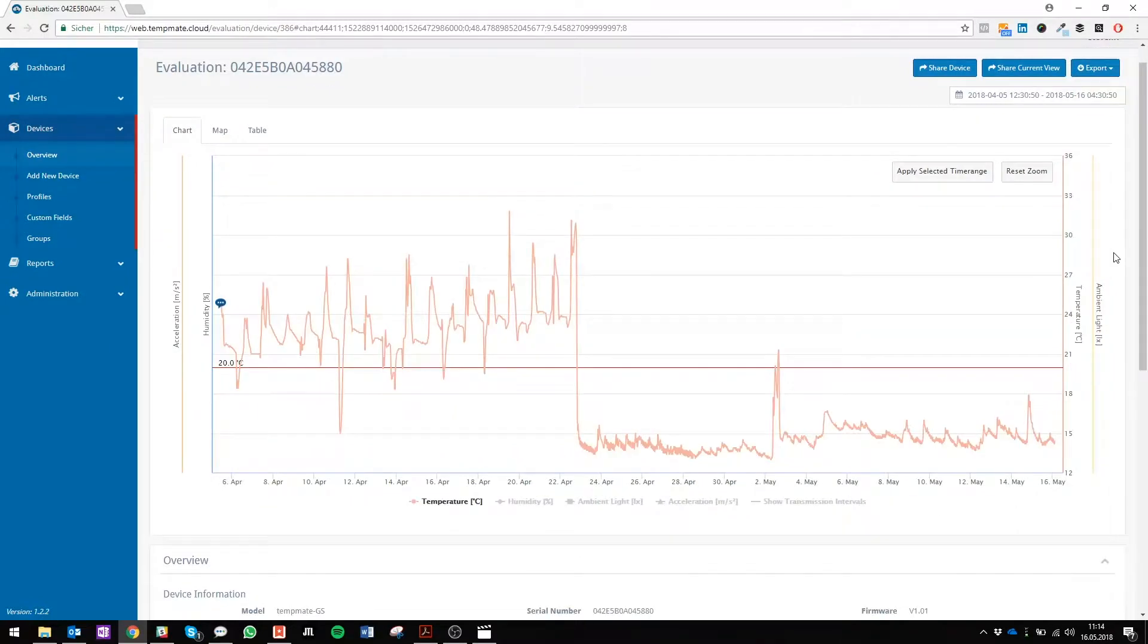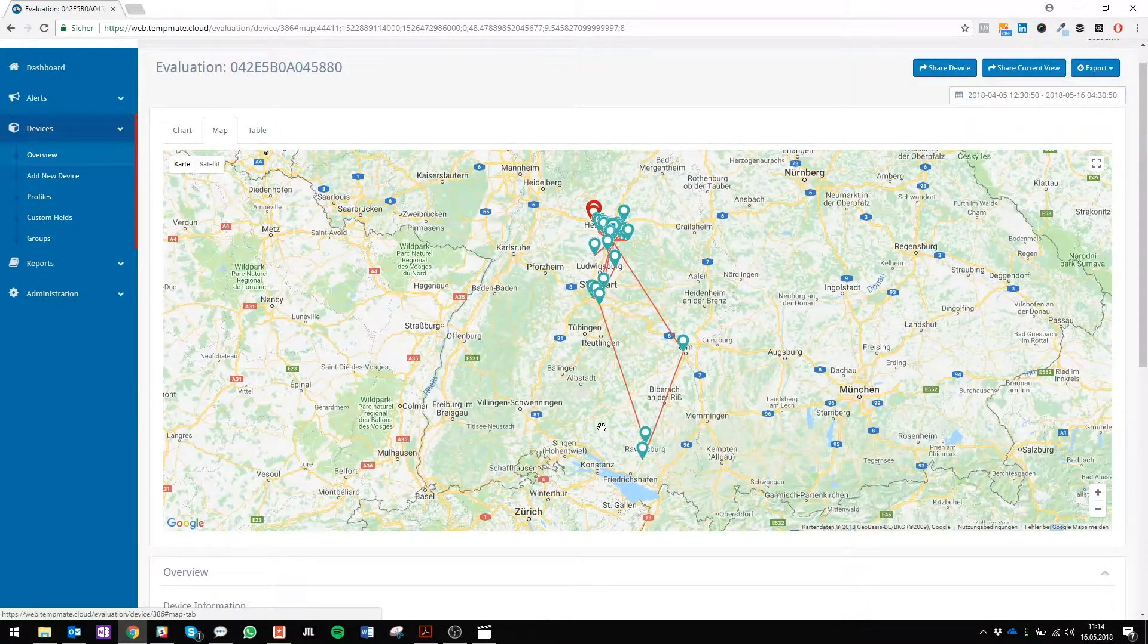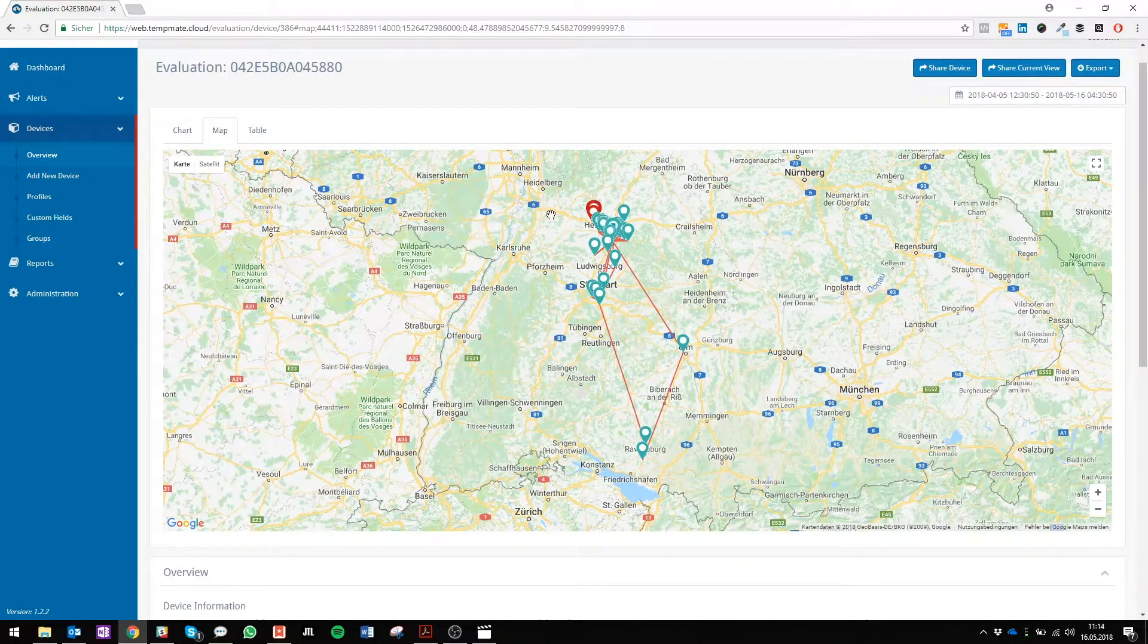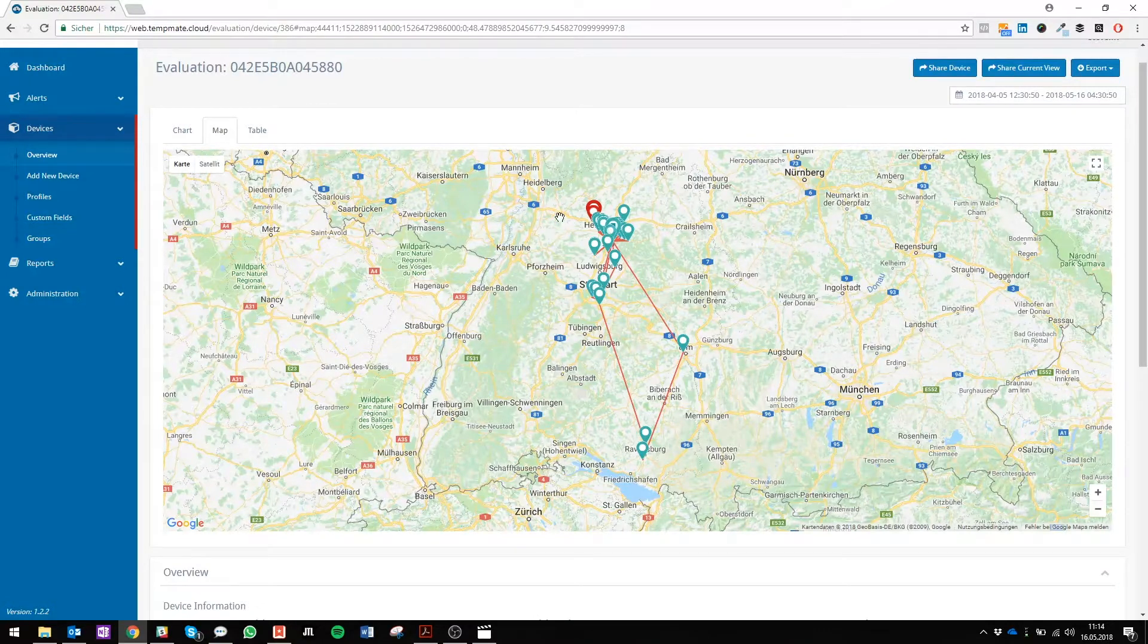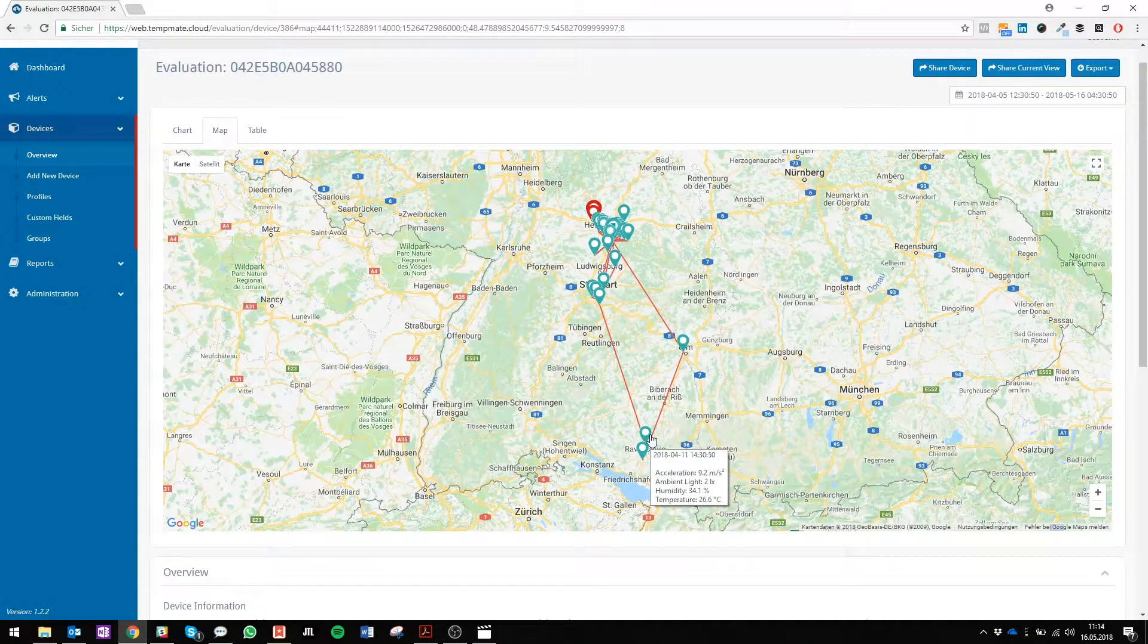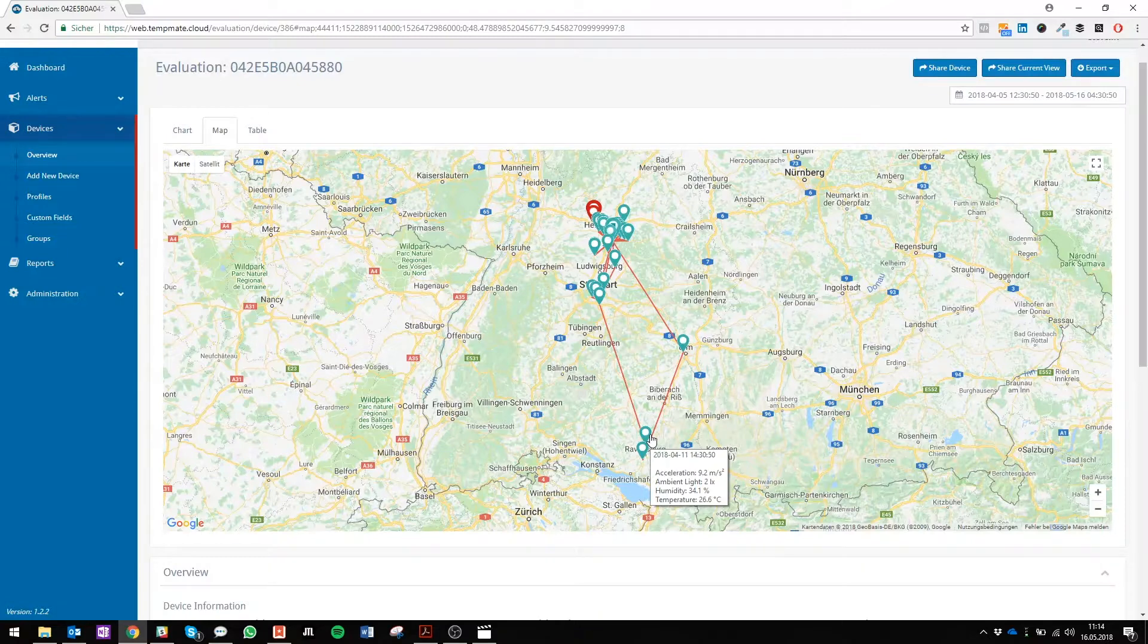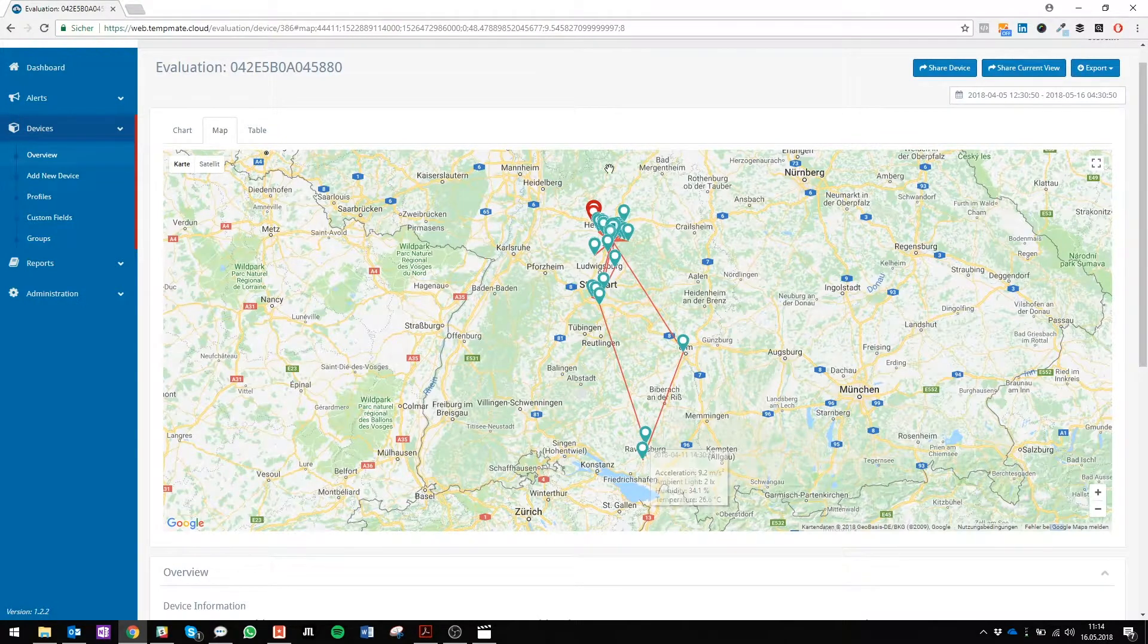When you're done with your chart analyzing, you can easily switch to your map view. Here you can see the route that your logger has made. All the flags on the map mark a certain logged time with your acceleration, ambient light, humidity and temperature. The red flags mark that your logger has initiated an alarm.